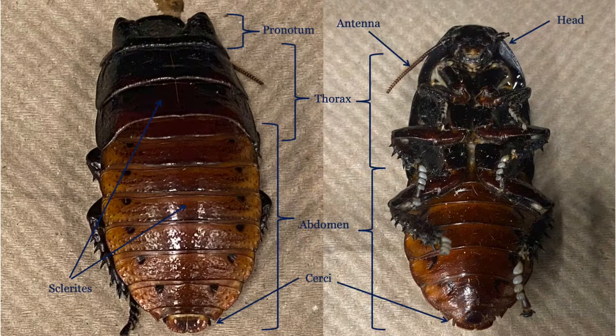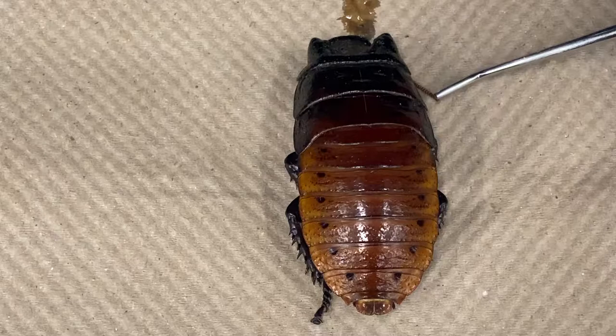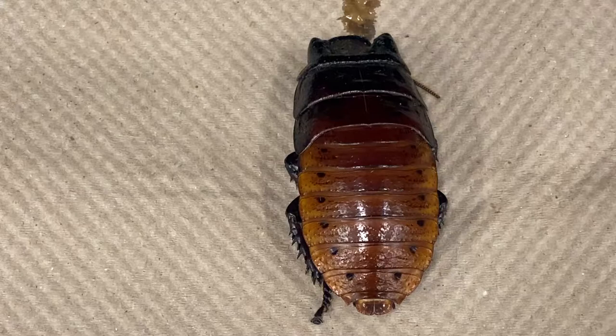Now we will examine some of the other features of the cockroach external anatomy. The cockroach is divided into three distinct body parts: the head, not visible from the dorsal side as it is protected by the pronotum, the thorax, and the abdomen. Here is an antenna, a sensory organ that cockroaches use to explore the world around them. This individual only has one antenna, as he has lost the other one.